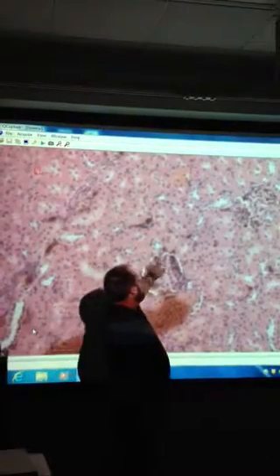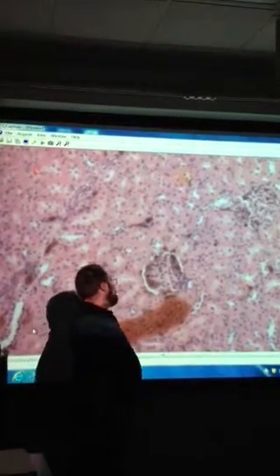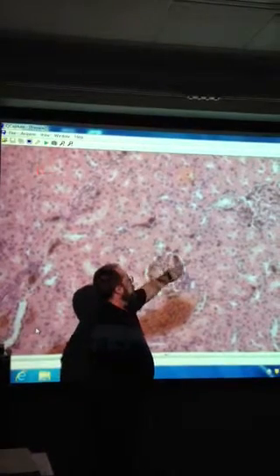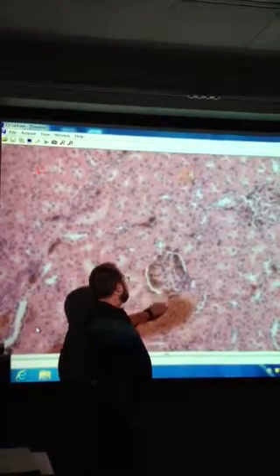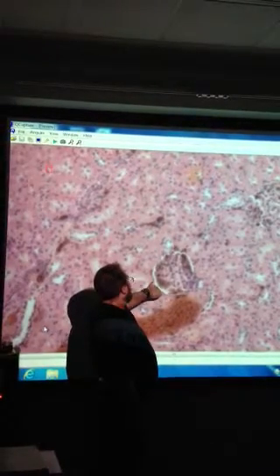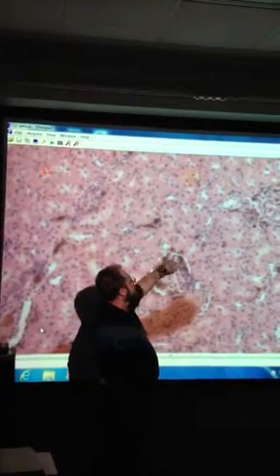Looks pretty good. Okay. So glomerulus, you can see some blood in it. This is a blood vessel passing nearby. You can see the capsular space and the glomerular capsule. See that nucleus there? A few flat nuclei. There's a simple squamous epithelium going all the way around there.